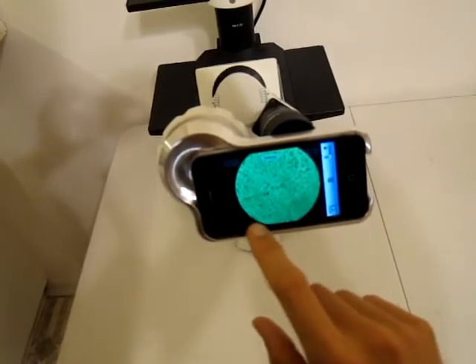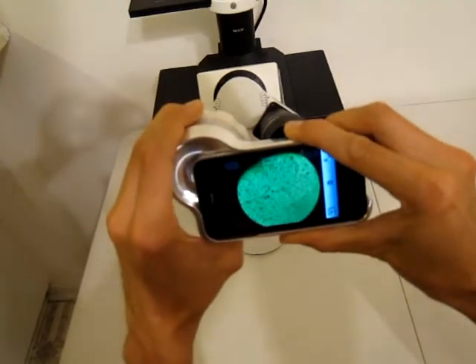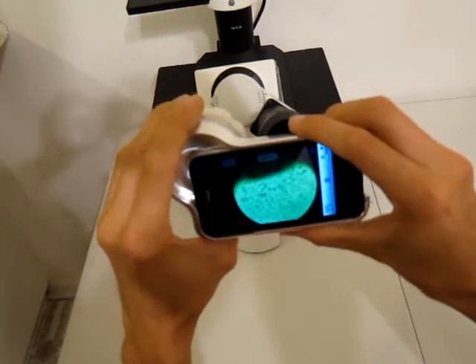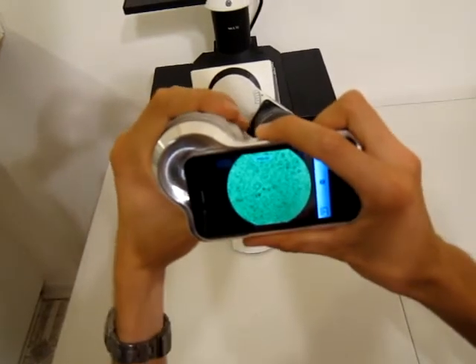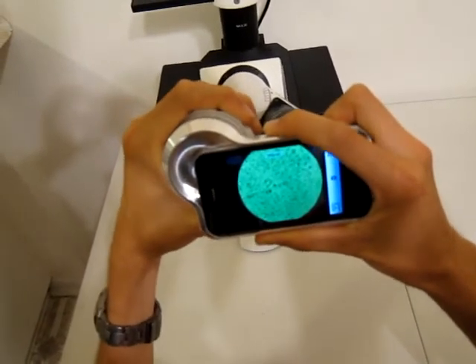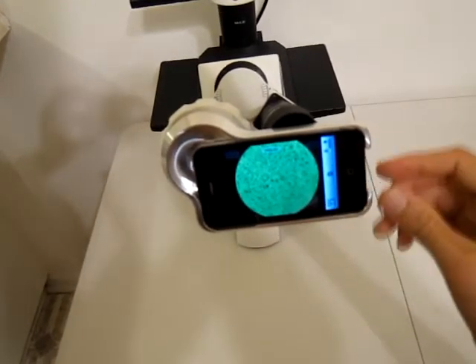If the edges are not crisp, it means it's tilted a little bit. So you can tilt it slightly and bring the edges back to being crisp, and then you can tighten it really well and it should be fairly solid and remain there.